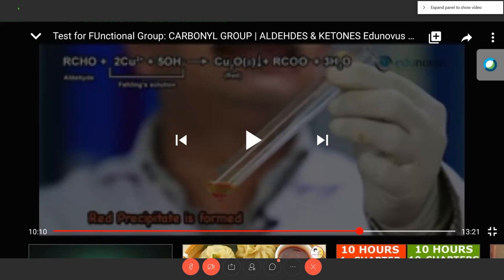The video showed the first test for the carbonyl group. We have discussed the 2,4-DNP test that confirms the presence of both aldehyde and ketone. But in Fehling's test, ketone is not responding, only aldehyde responds. Fehling's test is the test in which an equal mixture of Fehling A, alkaline copper sulfate, and Fehling B, sodium potassium tartrate, with the organic sample is heated in a test tube in a water bath for 5 minutes.